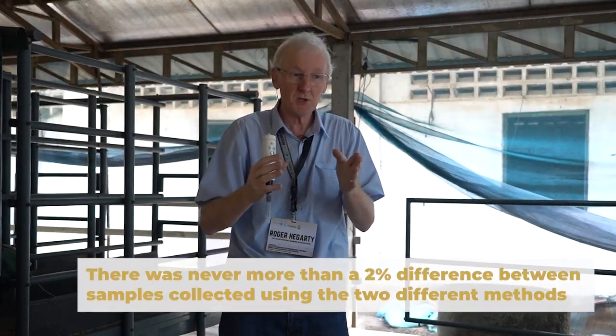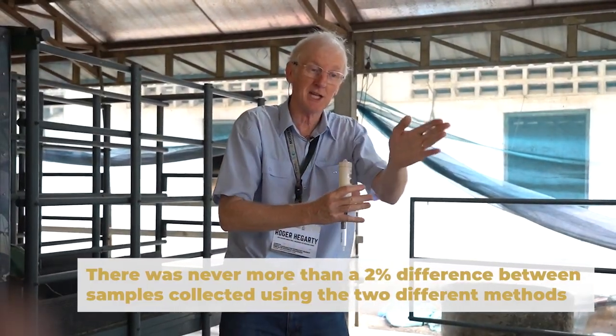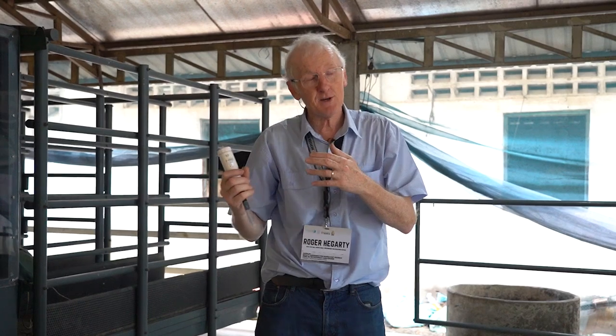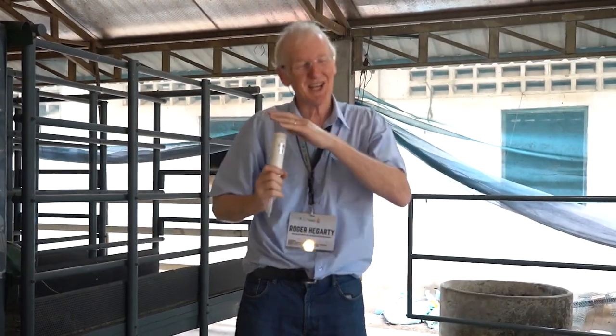And we have done many comparisons. They are never more than 2% different than you would get if you did the multiple collection, many sampling points. So the overall average for the day is the same, whether you collect one bulk sample. You cannot just collect one sample for 5 minutes. That would never work. But we collect all the time for the whole day.